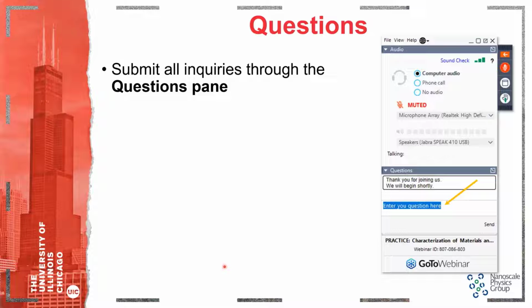Great, thanks. Another question related to the 4D-STEM data is what in general was the total acquisition time for the 4D-STEM data that you were acquiring, especially the strain mapping data that you showed? And what was the standard data set size that you were working with?